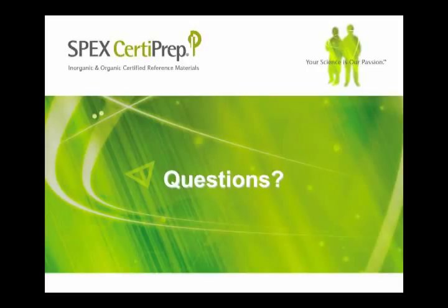Do you consider stability in the uncertainty? Yes, we usually do for our reference materials. In this particular case, I didn't go into that because my focus here is to calculate the uncertainty only by the instrument method. As I said, we are planning a few seminars on the overall uncertainty from the sample preparation, the purity of the salt, or the stability and homogeneity. In that, we will cover all those other aspects as well.